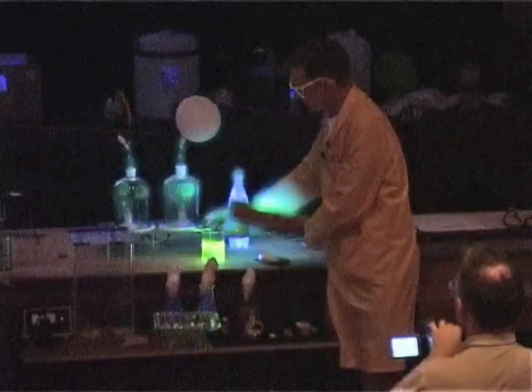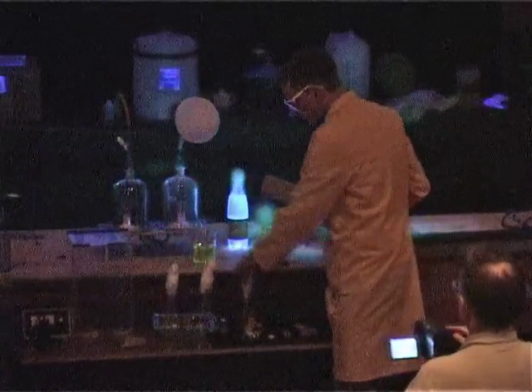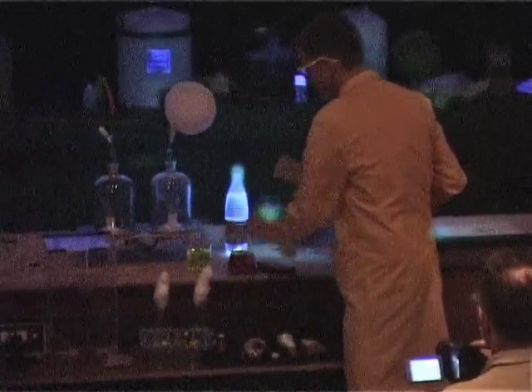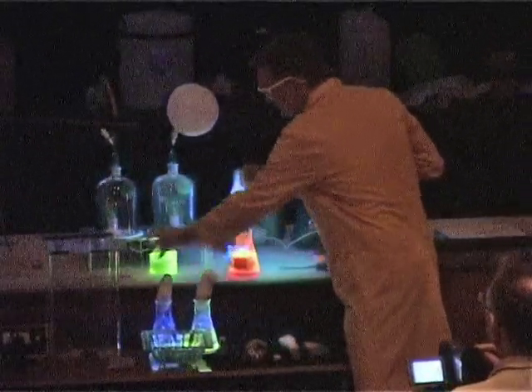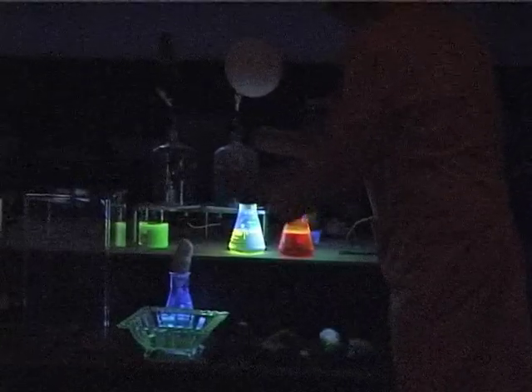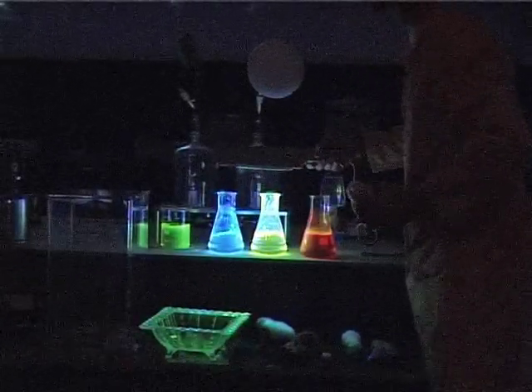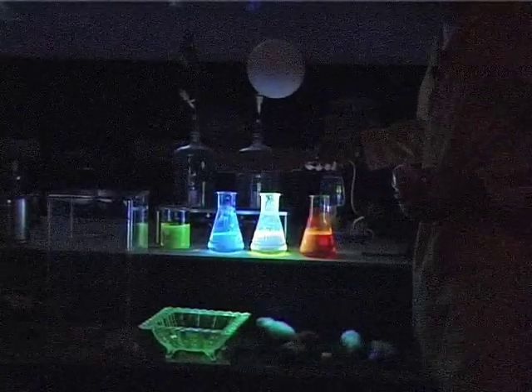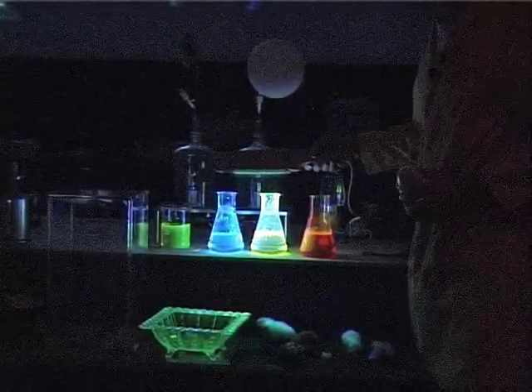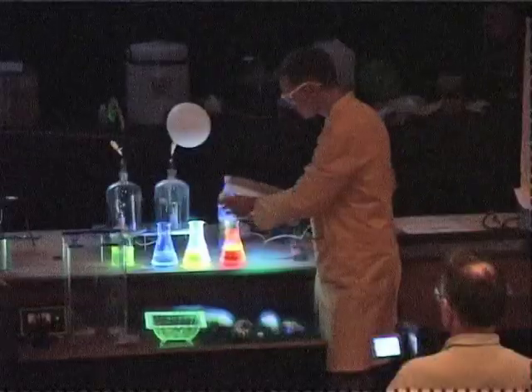I have some fluorescein here. This glows rather nicely. I have some solutions here. These solutions contain organic polymers that were actually discovered in this laboratory. We have a red polymer, a greeny-yellow polymer, and a bluey polymer. In fact, they're not only excited with UV light, they're also excited using an electric current. We're going to see these in the future making up our televisions.